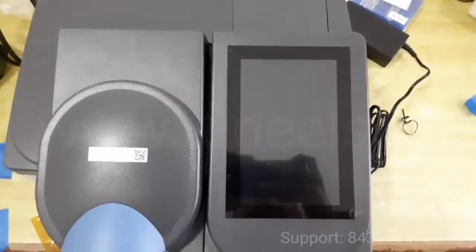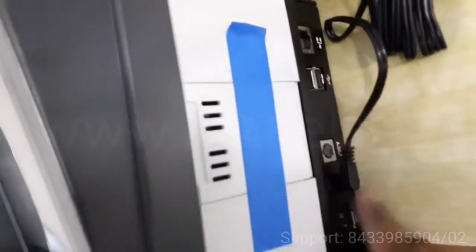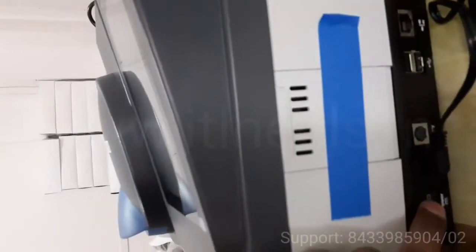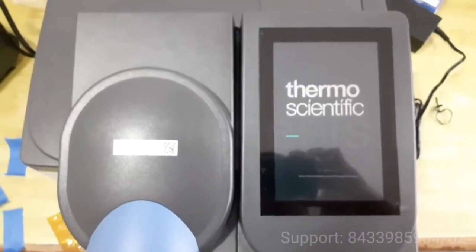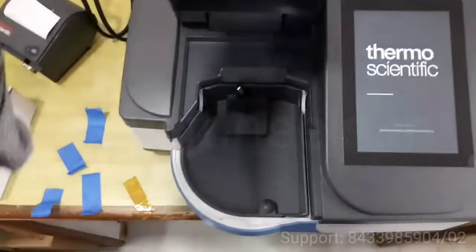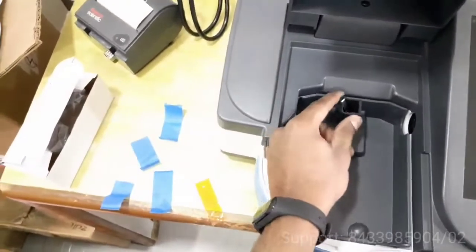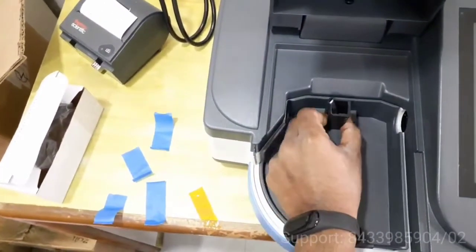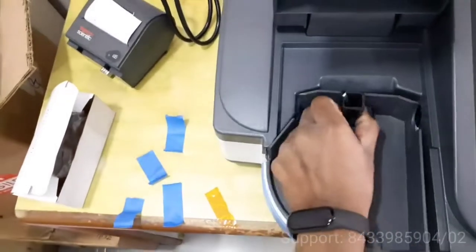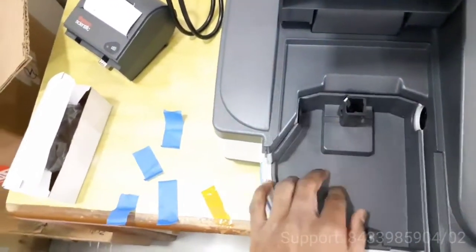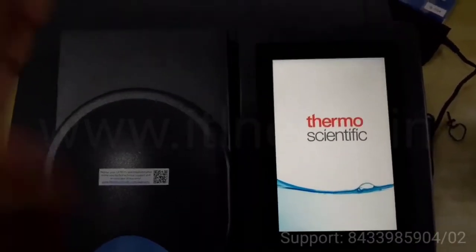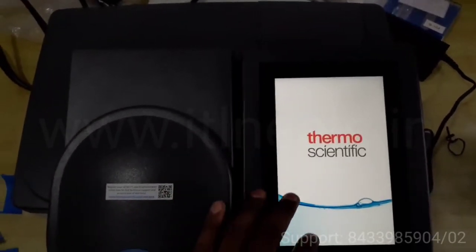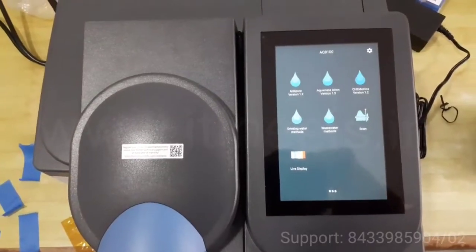To start the meter, first you have to attach the power adapter to the side, then press the on button. It will take some time to boot up. It comes with a 10mm standard cell holder. It is a magnetic cell holder that automatically gets attached. This is the start screen, a total touchscreen instrument.